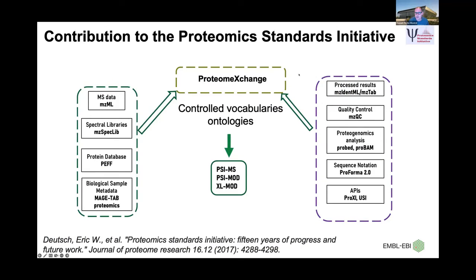ProteomeXchange is also heavily involved in the development of standard file formats within HUPO. A lot of work goes on behind the scenes in the development of standards for storing data like mzML, all of them very popular, and most of the search engines and software tools export into them. The creation of these standards makes it possible, in the long term, to interpret the data.